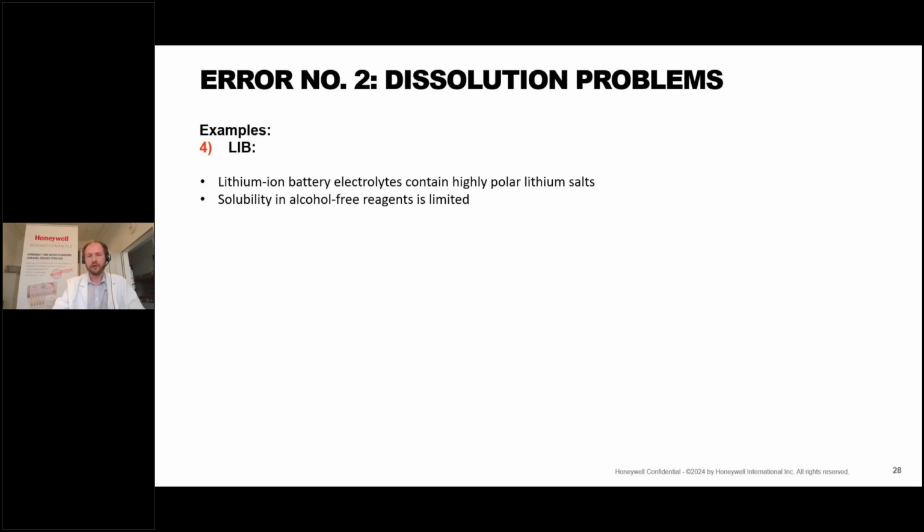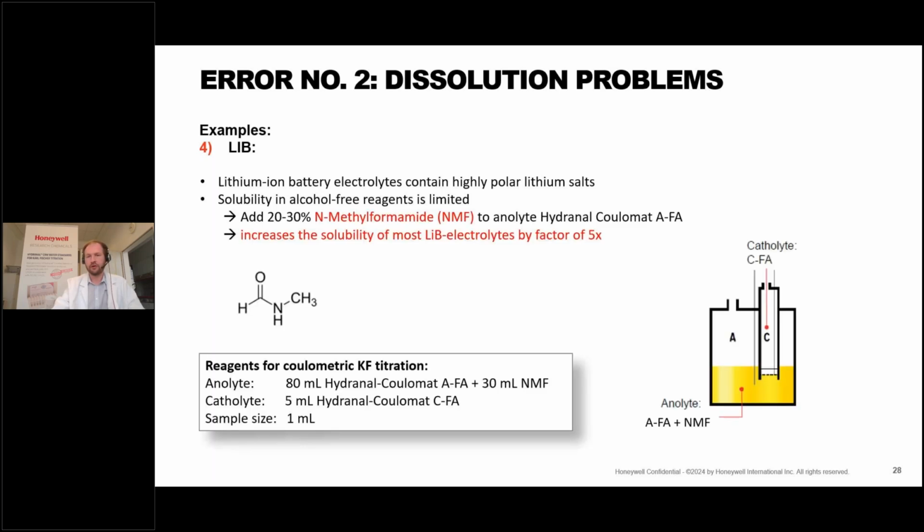And especially with our new alcohol-free reagents, AFA and CFA, the solubility of some lithium salts is limited. However, we found out that the addition of N-methylformamide, NMF, to the analyte can increase the overall solubility of many LIB salts by a factor of 5x.